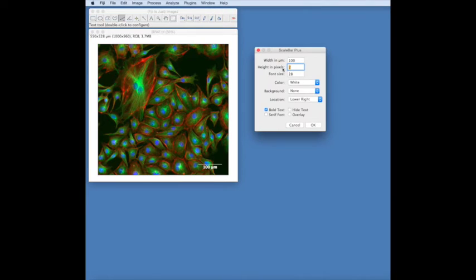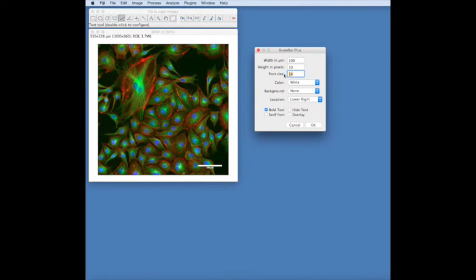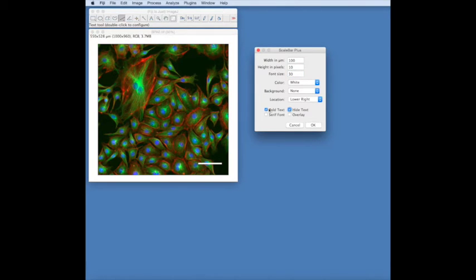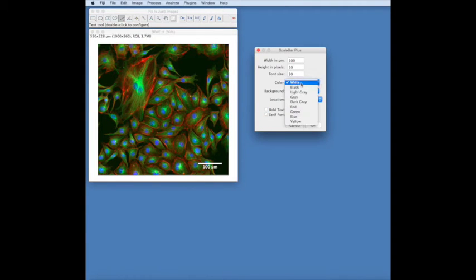We can modify the font size, we can hide the font so we can just see the scale bar, we can make the font bold or not, change the colour.